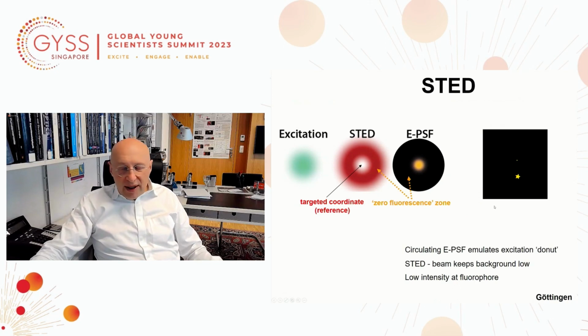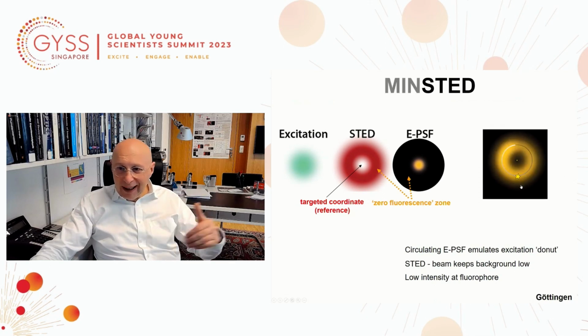But of course, we have the ambition of getting better and better. And one way of doing it is to turn molecules on individually, as we've seen before, but now use this coordinate-targeted approach of STED in order to get higher precision information.